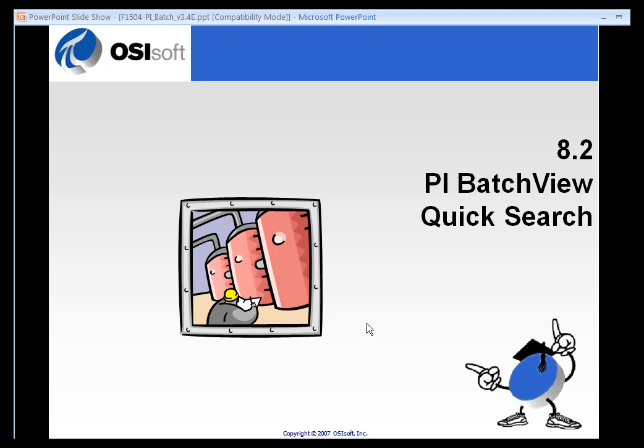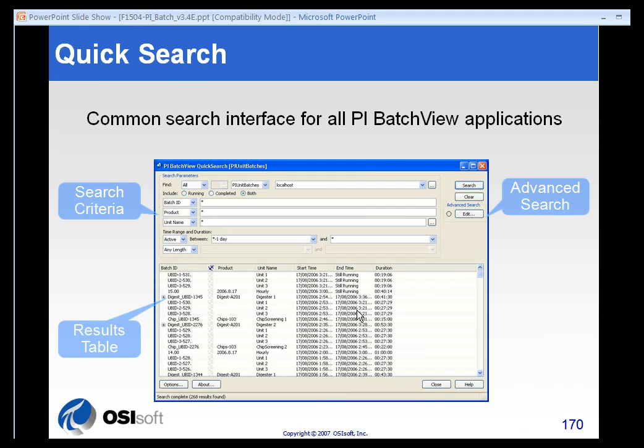The PI Batch View Quick Search function allows you to search your batch information without having to go into any of your client tools. So if you just want to see what's running or what ran with certain parameters, you can do it very quickly without having to have a client tool loaded and figure out how to create a display or create a report. It's a very easy tool to use.